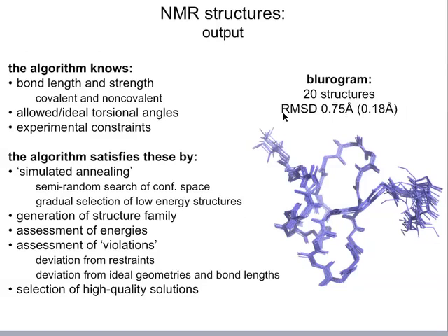and that's for all atoms. So what is an RMSD? This is an interesting term. Root mean squared deviation. Basically, if we calculate one average structure, we can say how far away from that structure any individual atom is. And for all the atoms in the molecule, we'll say it's 0.75. But if we only consider backbone atoms, it's much tighter. So that's an interesting detail as well.